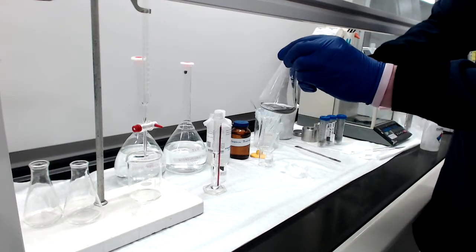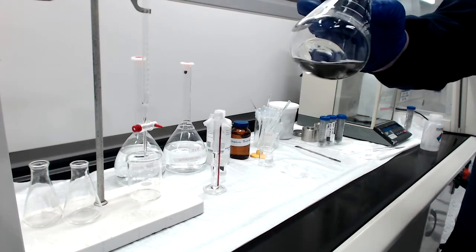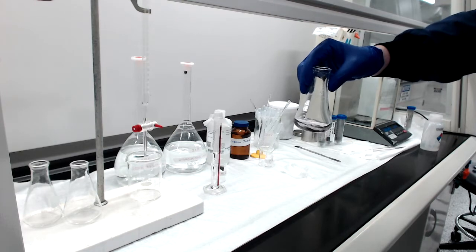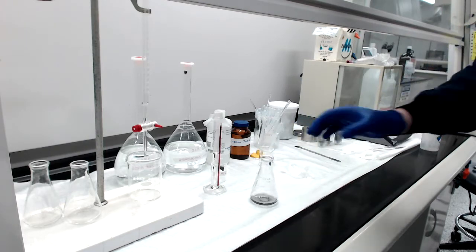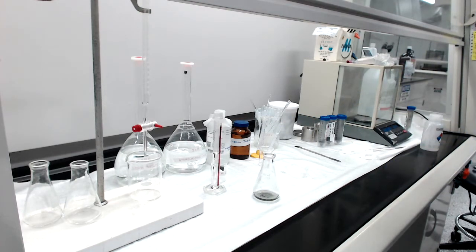You can see that the solution looks clear — there are just remnants of our powder. Nothing's really changed; we've just added a little bit of water and the potassium iodide. Nothing should have happened solution-wise yet — we've just added KI as a protectant essentially at this point. The next thing we need to do is add the 15 milliliters of the HCl solution.